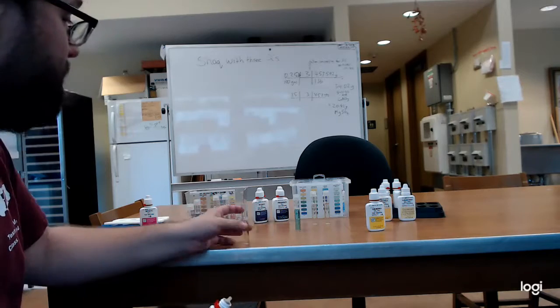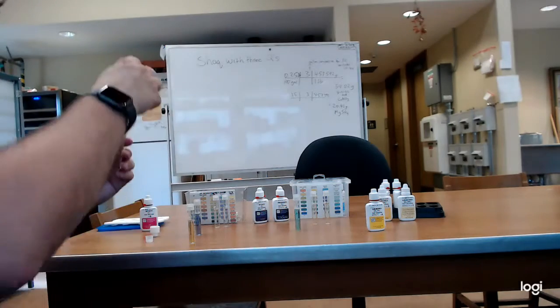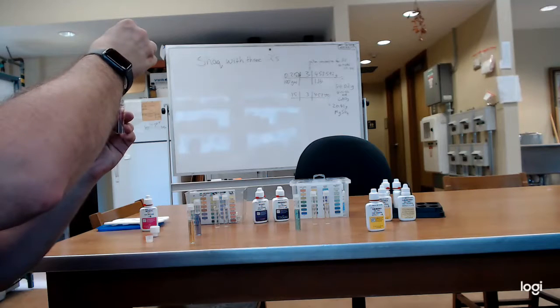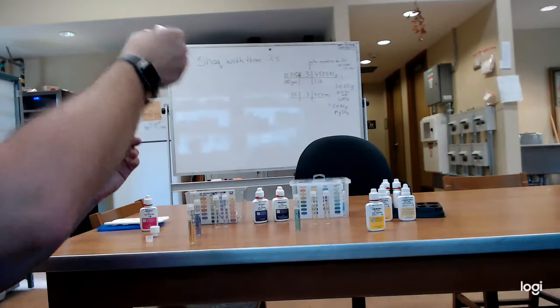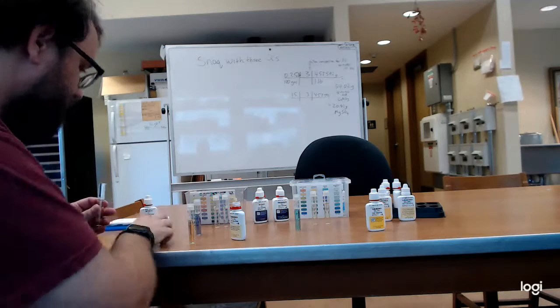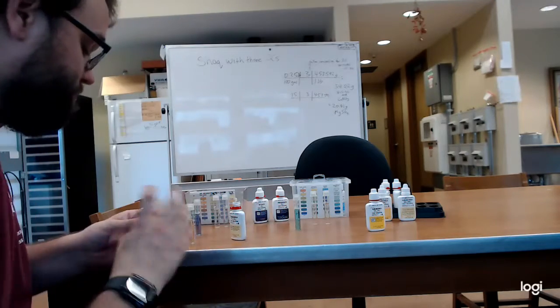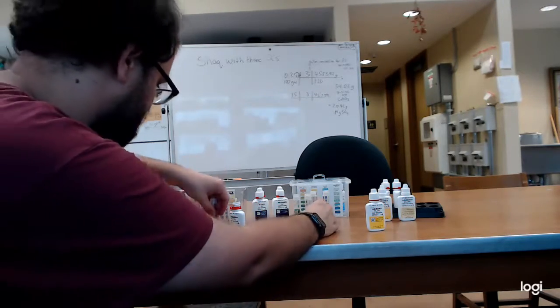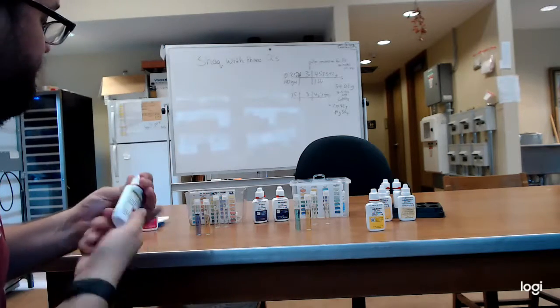And normally you're going to want to read the instructions for each of these titrations. I've been doing them for a while now, so I'm fairly familiar with it. And it's something that I've been doing at home for personal and here at the school for research. And I'll do my best to try and keep them in the order that we're doing them in.